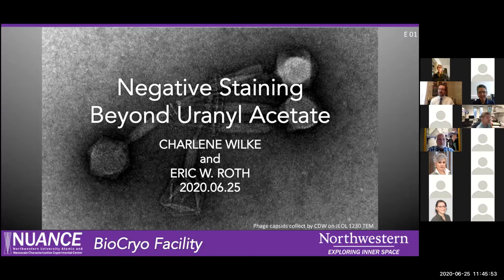Yeah, if you can stay away from uranium, all the better. And there are a lot of commercial ones out there too, available through Nanoprobes. Through EMS, you can get a lanthanum-based stain, which is kind of interesting. I played around with that. Again, contrast is not as high, but there are a lot of options out there. So Charlotte, if you want to discuss that with Charlene and I later, we can absolutely investigate that further for you. I don't know exactly what the least toxic one is, but we can try to figure that out.